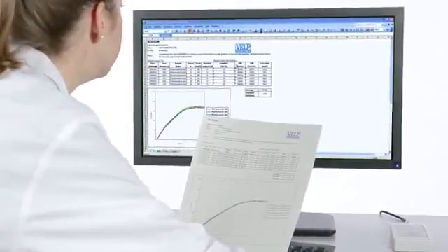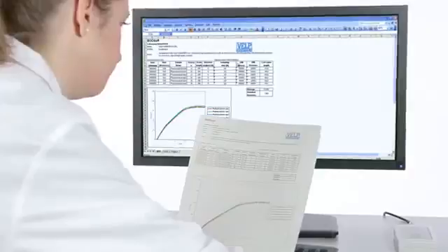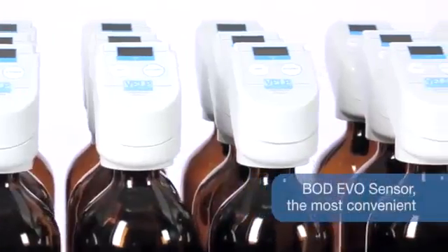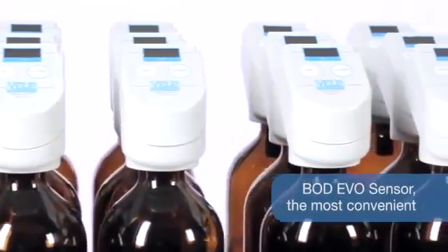All the results and reports can be output to a printer or saved for GLP compliance. BOD EVO is the most convenient way to get reliable results automatically on the biochemical oxygen demand.